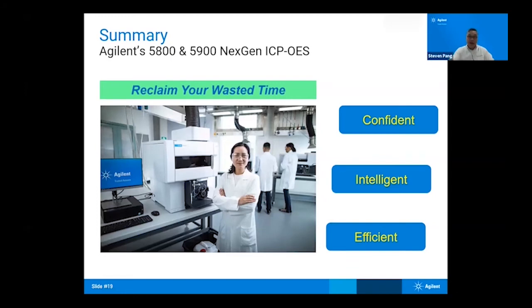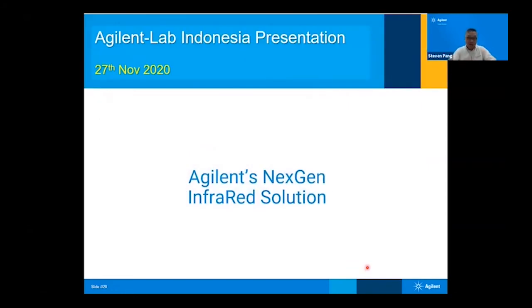Okay. So that brings me to the end of the first part of the presentation, and I shall now go into the Agilent next generation infrared solution.